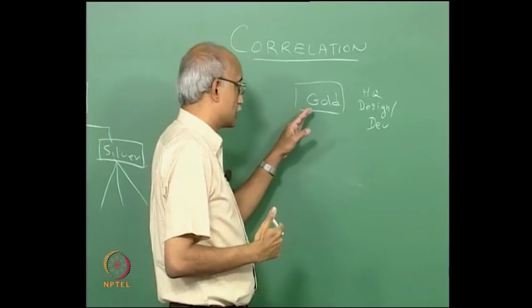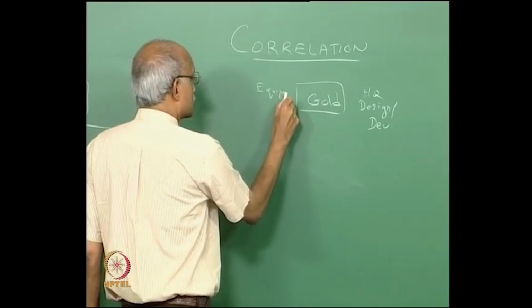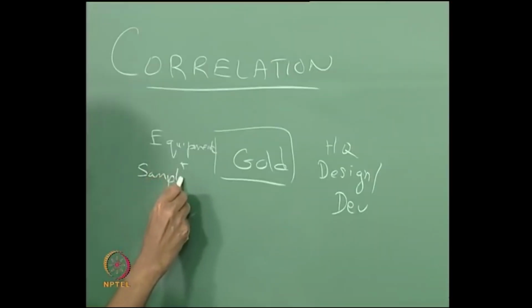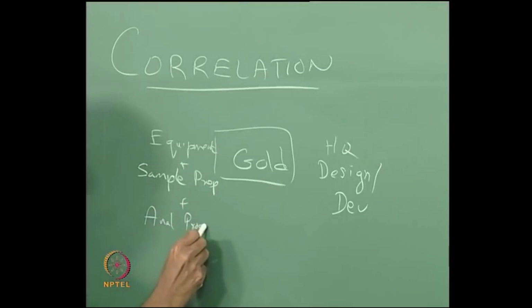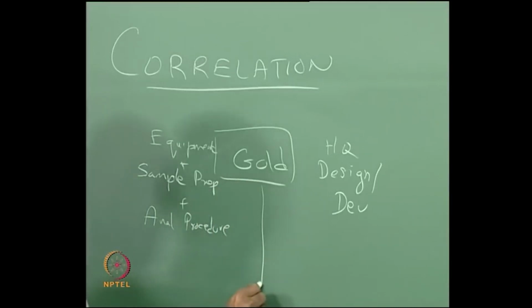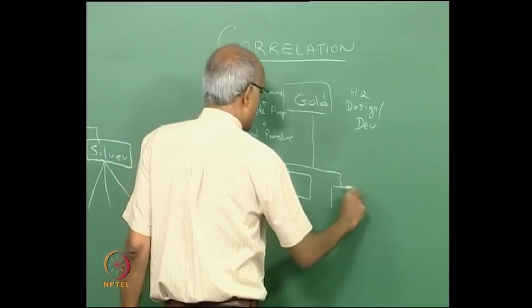And so, this includes the equipment part plus sample preparation plus the analytical procedure. And then this will be compared to various site specific instruments.